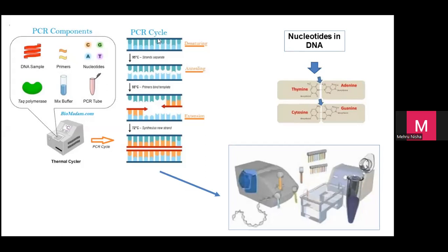Okay, so this is how it goes. Ini baru satu cycle. Pecah, anneal, extend, elongation. Ini akan repeat untuk 30 cycle. 30 atau 40. Actually 30 should be okay. 30, then you akan dapat produk yang berlambak. So you can see, benda semua ni kita bubuh dalam one tube, bubuh dalam mesin, run gel.